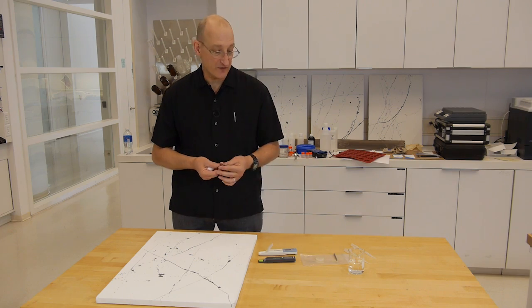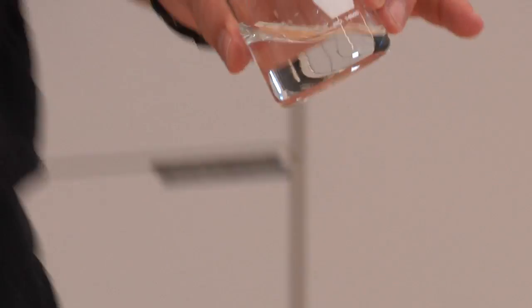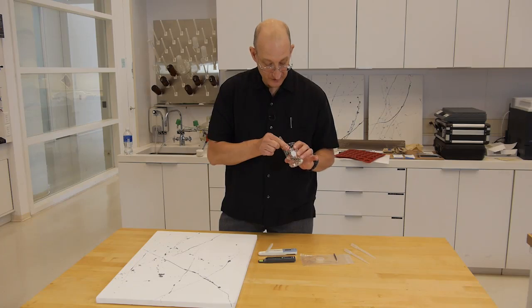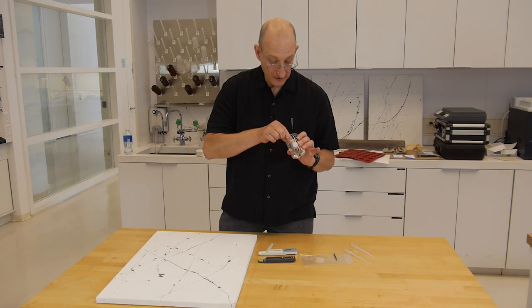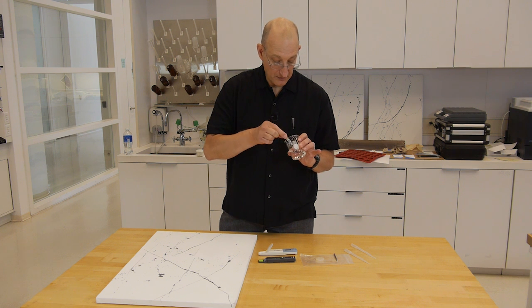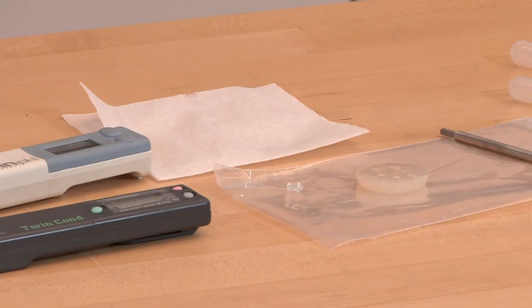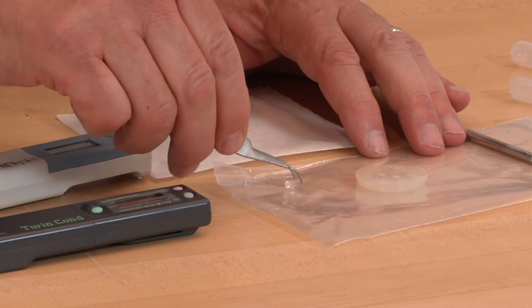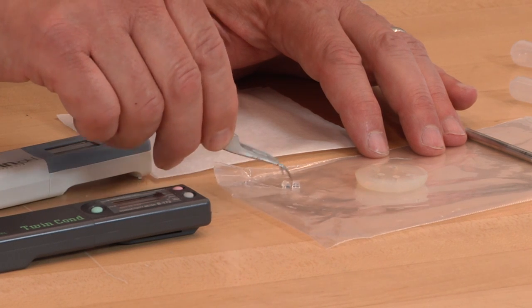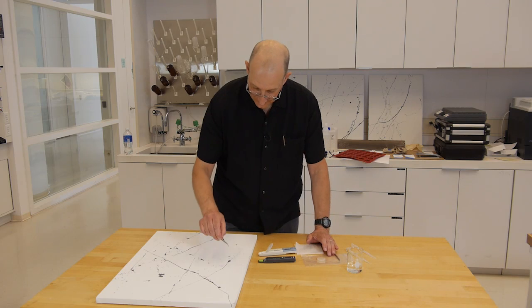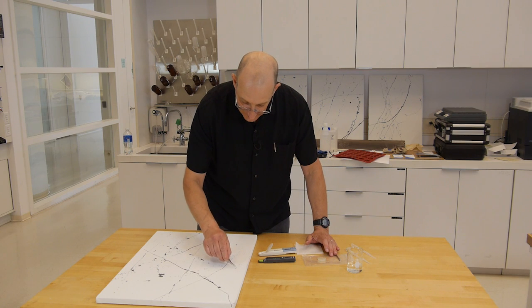So once they've been rinsed, we fish one of the plugs out of the distilled water where we're rinsing that preservative out. Retrieve it with our tweezers, which is not as easily done as said. We cut off a piece of that plug for our measurement, blot the excess moisture off with tweezers, and place that on the surface.